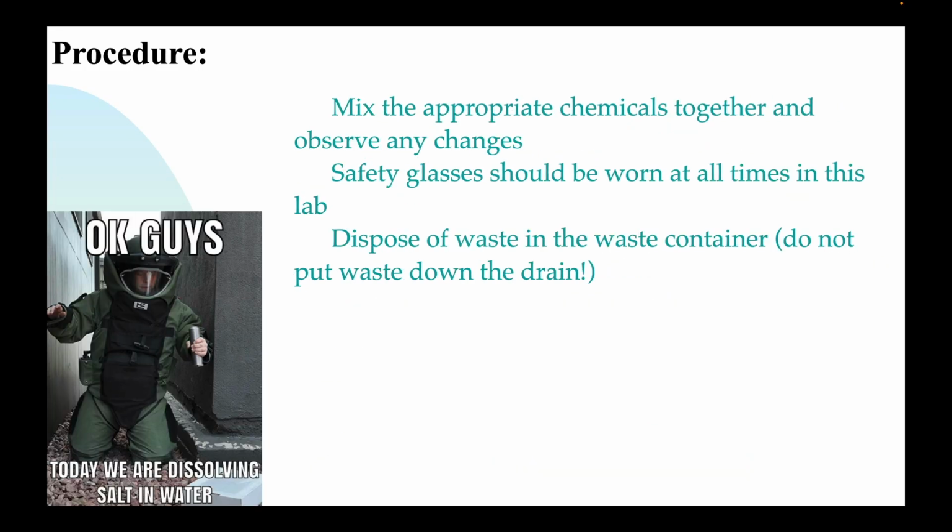So in this lab, mix the appropriate chemicals together and just observe for any changes. And again, some of them won't have any changes, but you could see solids, you should see gases and stuff like that. Safety glasses should be worn. You're dealing with some pretty strong acids and bases, so it's a good idea to be safe. And none of the chemicals today are fish friendly, so try to dispose all of the waste in the waste container in the hood. Don't put them down the drain.